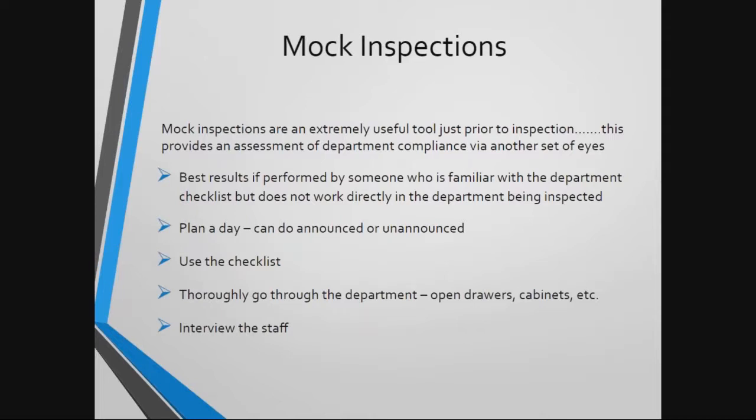While mock inspections definitely require a time commitment, they are so very beneficial. It is most helpful if the mock inspection is performed by someone who is familiar with the checklist for the department, but does not necessarily work in the department being inspected. This is to eliminate the bias you might see from staff who are in the department every day, and to have an expert evaluate compliance from another viewpoint. This activity can be as in-depth as you want it to be.